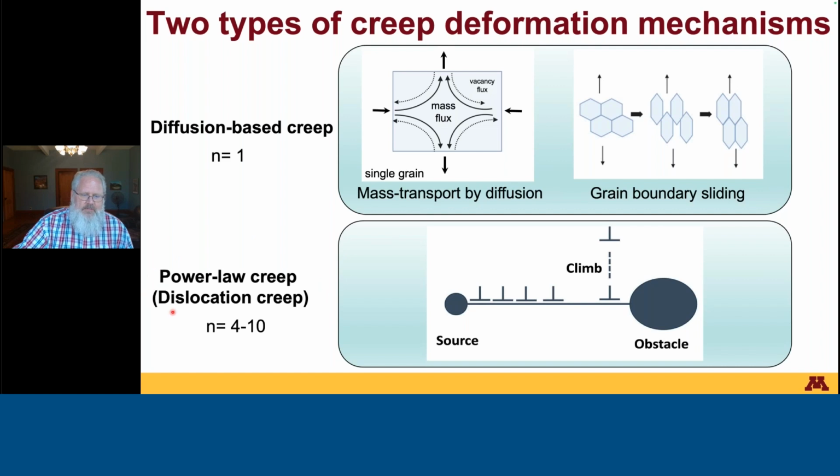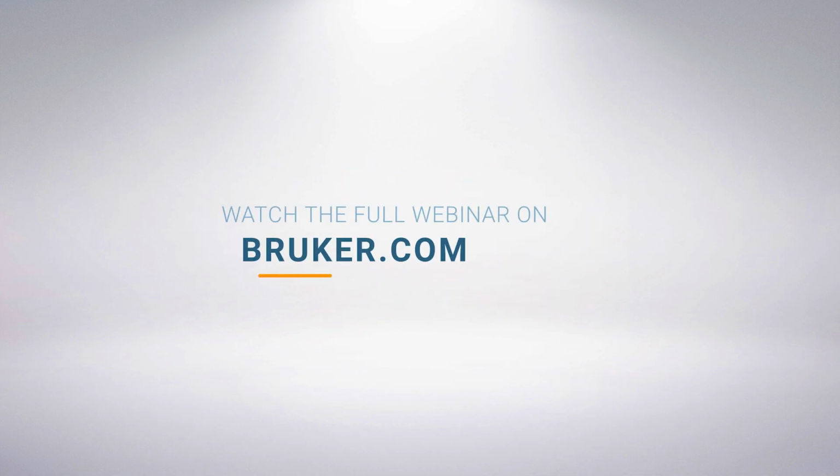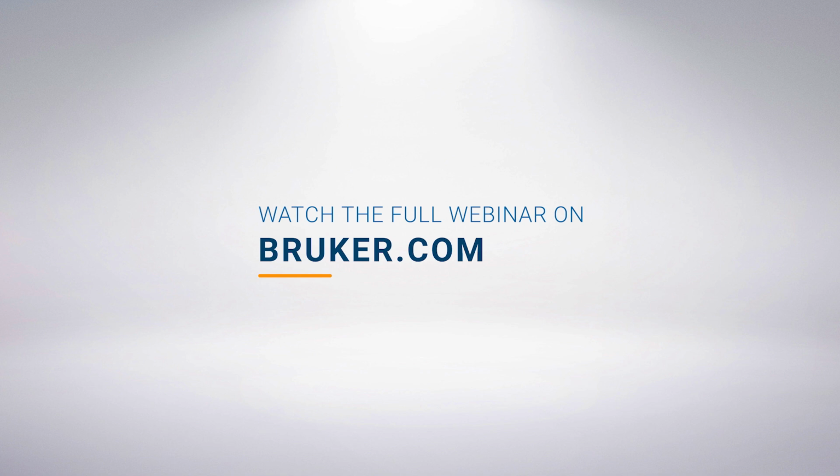Power law creep is a completely different mechanism where we have a source for things like dislocations. Dislocations then glide along on a slip plane until they hit an obstacle and then have to climb around it. The rate limiting step here is climb. It ends up having a higher stress dependence than what we would see for diffusion-based creep, because it's dislocation based. So we have a stress exponent somewhere in the realm of 4 to 10. Now, if we're at a little bit lower temperature than where we usually see creep mechanisms, we can also see the mechanism known as dynamic strain aging, DSA.